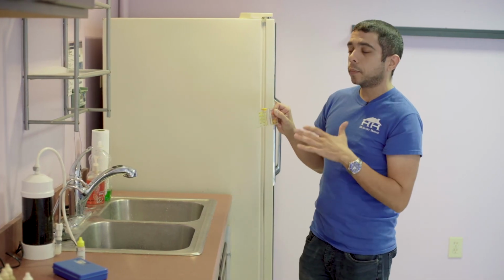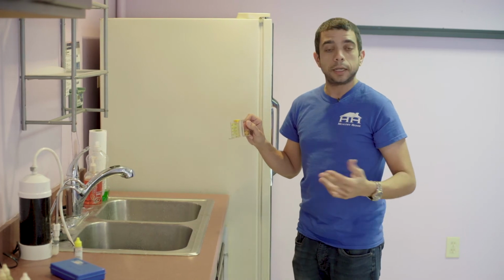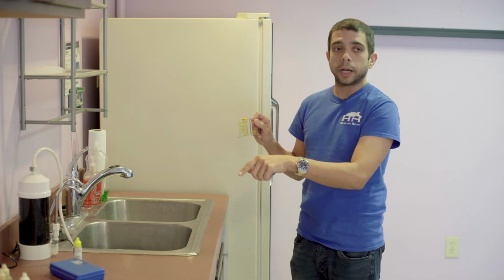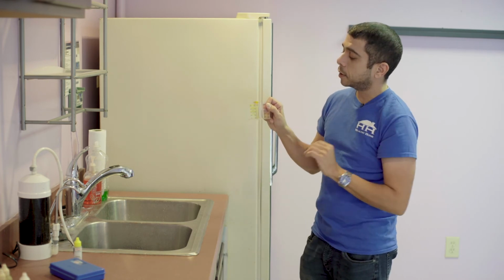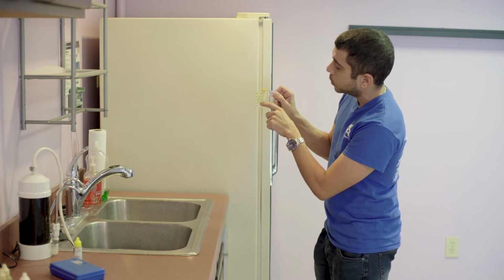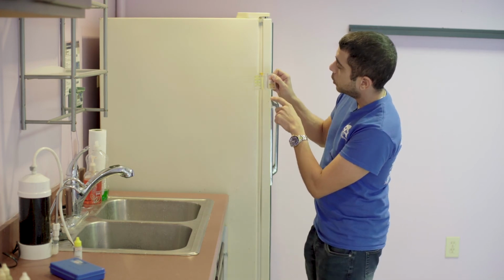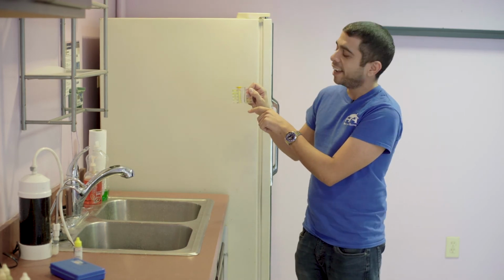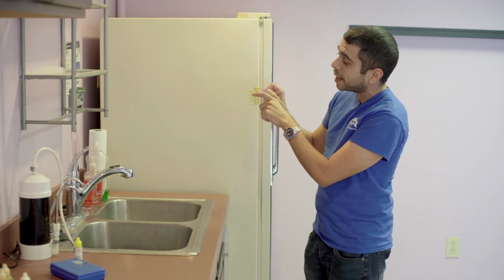The interesting thing about this specific test, as you can see, is I put tap water in here. This is a pool test kit made by Clorox. They know what they're talking about, and they say the safe chlorine range for a pool is between the 1 and the 2 right here. Now you can see, very simply put, that it's pretty yellow, and it's easily right in there, if not higher.